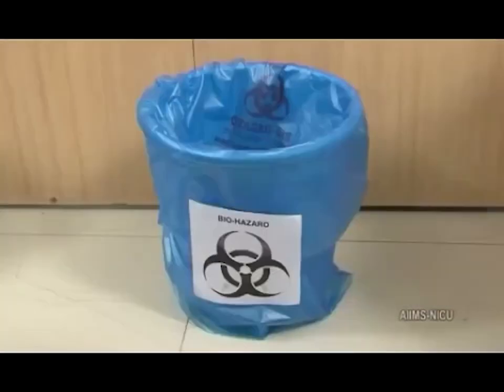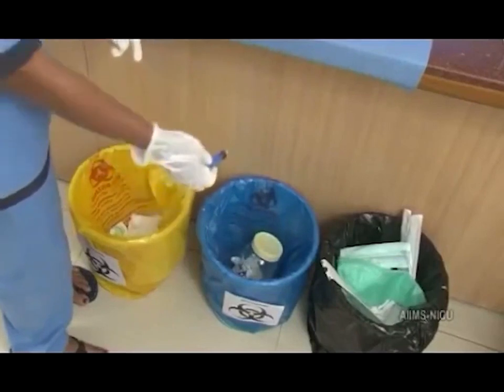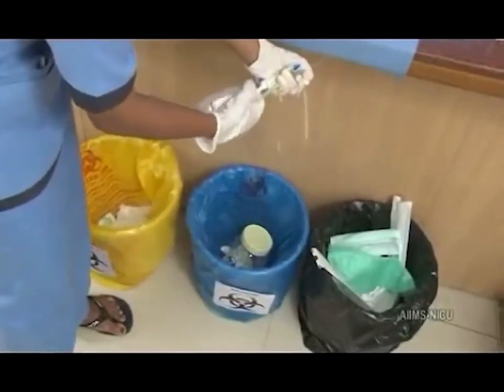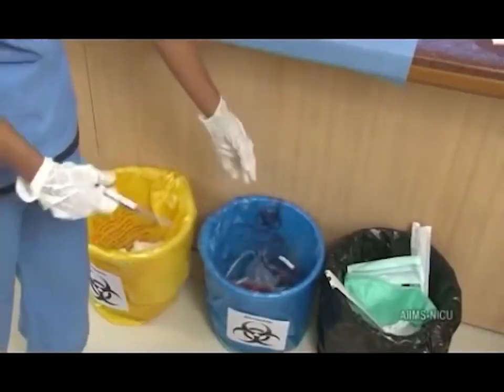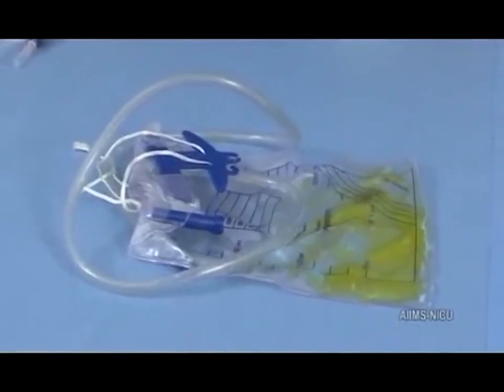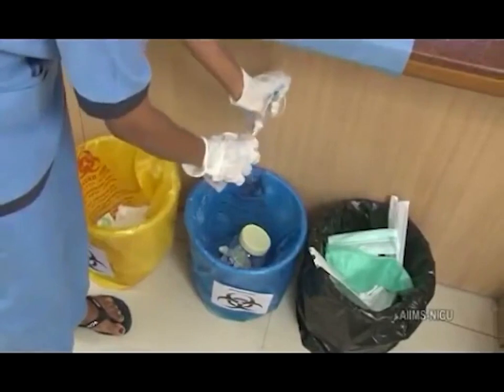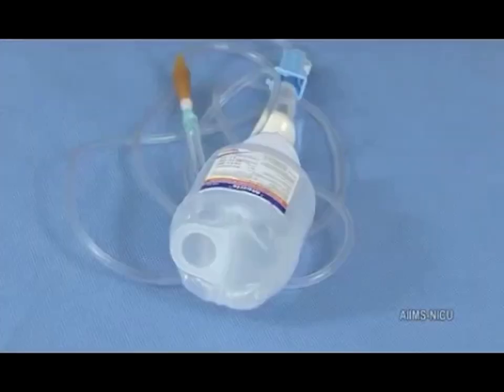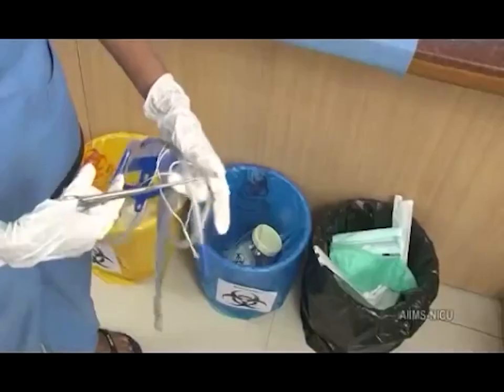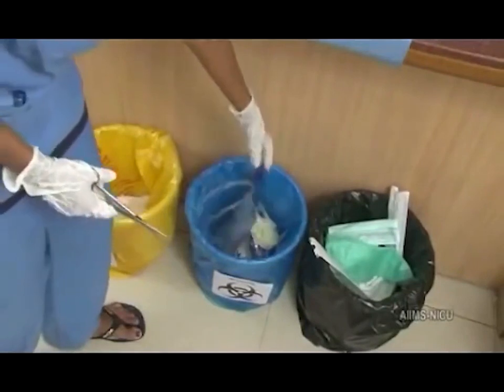The items to be disposed of in the blue bag include all the infected plastic waste, such as disposable syringes, the intravenous set, the blood transfusion set, the endotracheal tube, urinary catheter, urine bag, and medication vials. The IV set, the blood transfusion set, the endotracheal tube, the catheter and the urine bag should be first cut into pieces and disposed of in the blue bag.